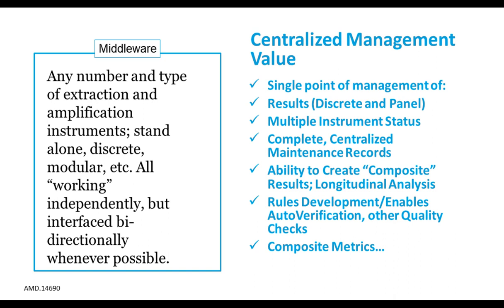It's meant to give you multiple instrument status in one single console. It's meant to give complete centralized maintenance records from all the instruments that might be interfaced. Its real strong ability is to create what I call composite results, and looking at data longitudinally over time and space to look at trends and things and be more prognostic.